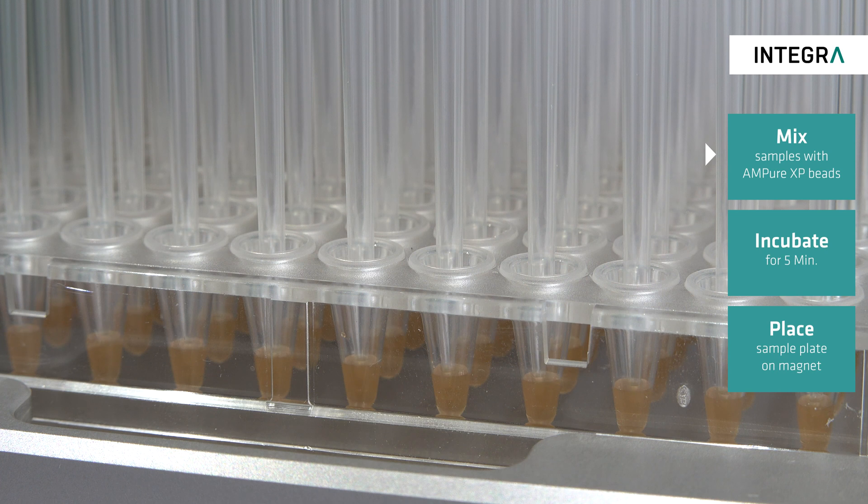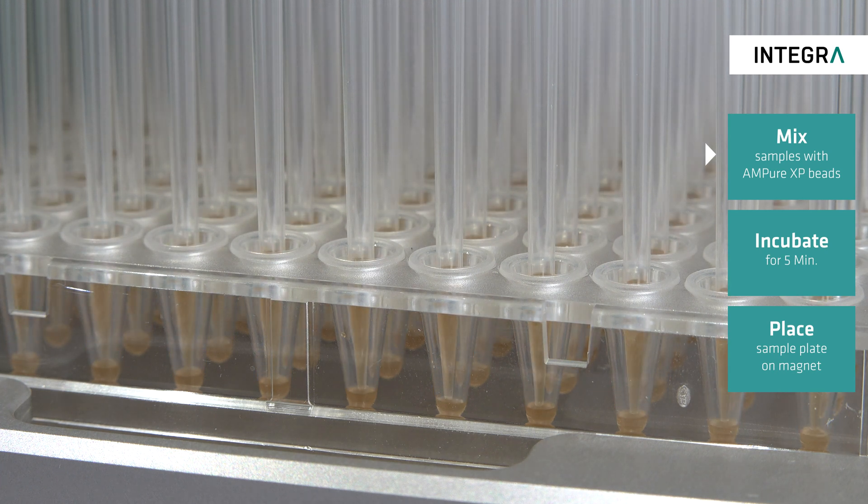First, the beads and samples are mixed thoroughly to ensure a homogeneous mix and left to incubate for five minutes for binding.